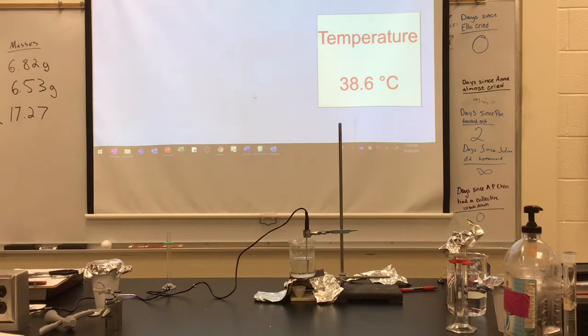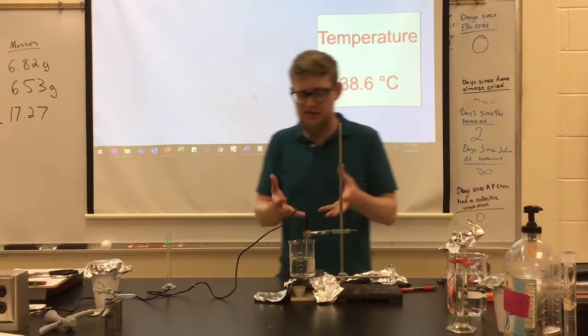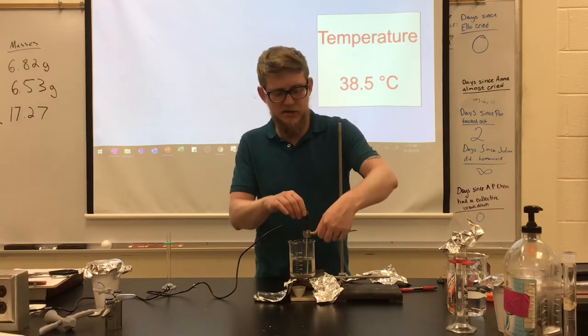Okay, so you should have marked down what temperature it was initially. Now it's at 38.6 for the maximum. All right, it's going to start slowly going down here over time. This was our heat of combustion experiment.